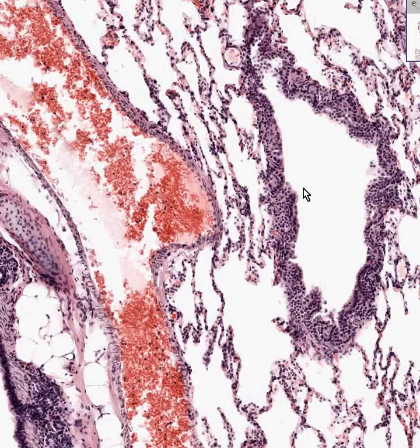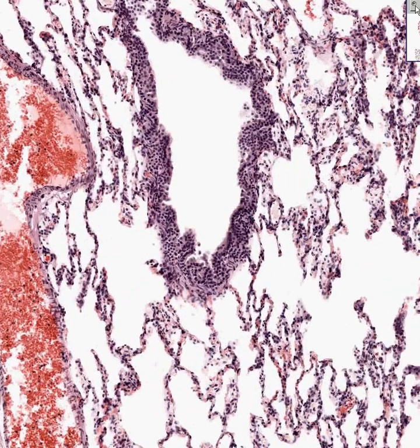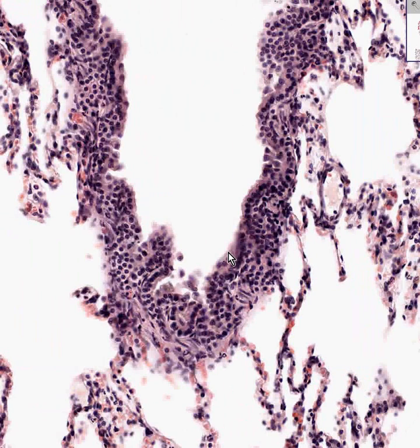Here is a bronchiole in which, because you do not see cartilage, and it is also lined by an epithelium which is, like in the bronchus, columnar, pseudostratified, and ciliated.